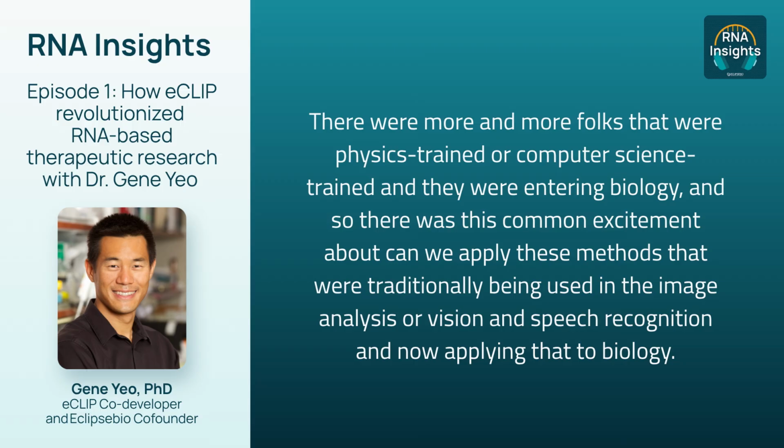In this step, researchers isolate the targeted proteins in the RNA by using a selective antibody that binds to that desired region. Once bound by the antibody, researchers wash away the rest of the RNA, leaving only the targeted proteins and RNA behind. Having the correct antibody for this process is critical.